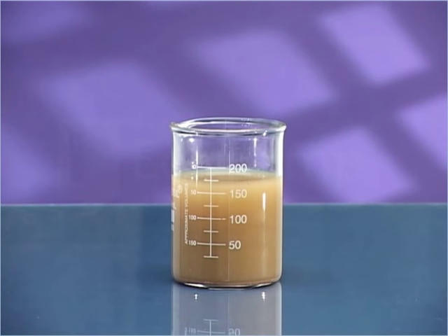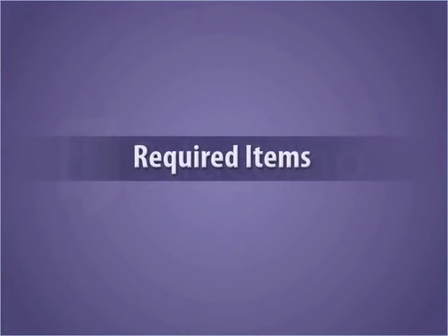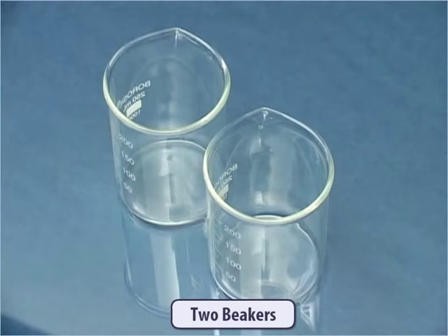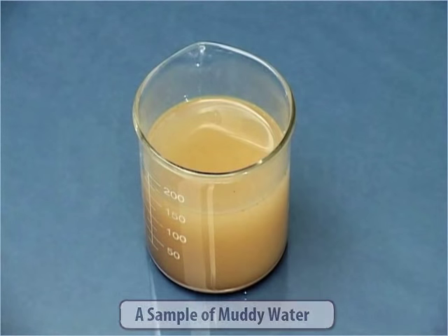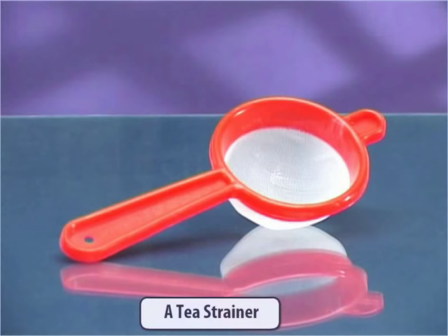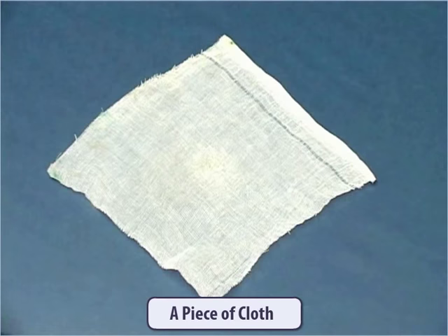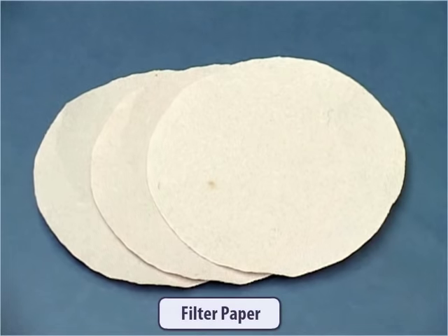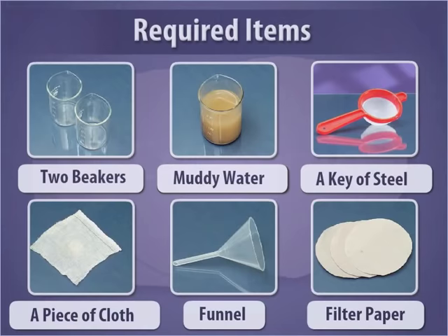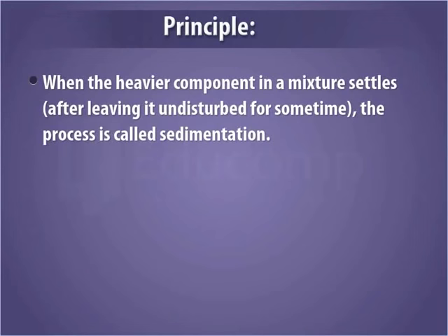For this activity we need two beakers, a sample of muddy water, a tea strainer, a piece of cloth, a funnel, and filter paper. When the heavier component in a mixture settles, the process is called sedimentation.